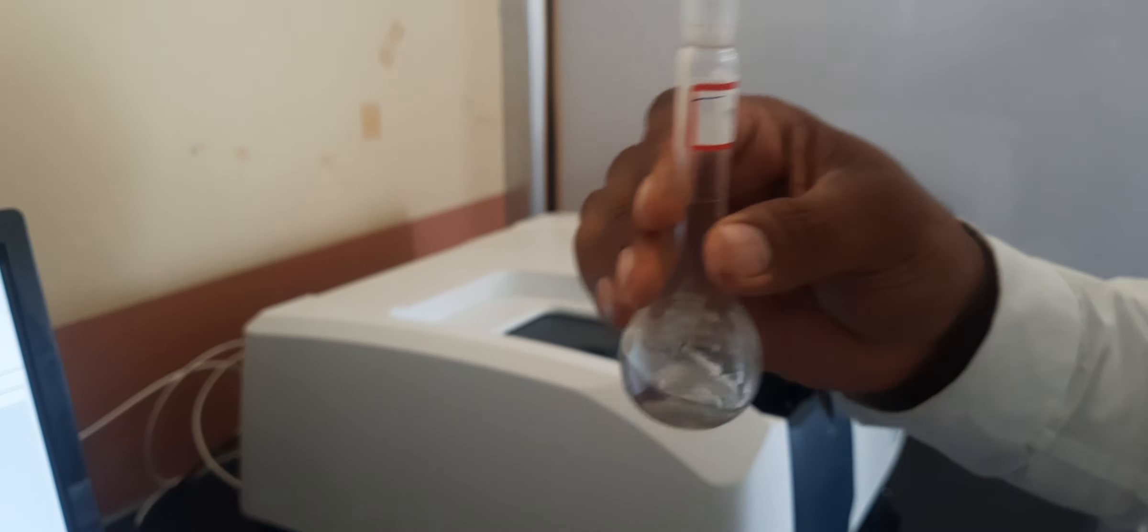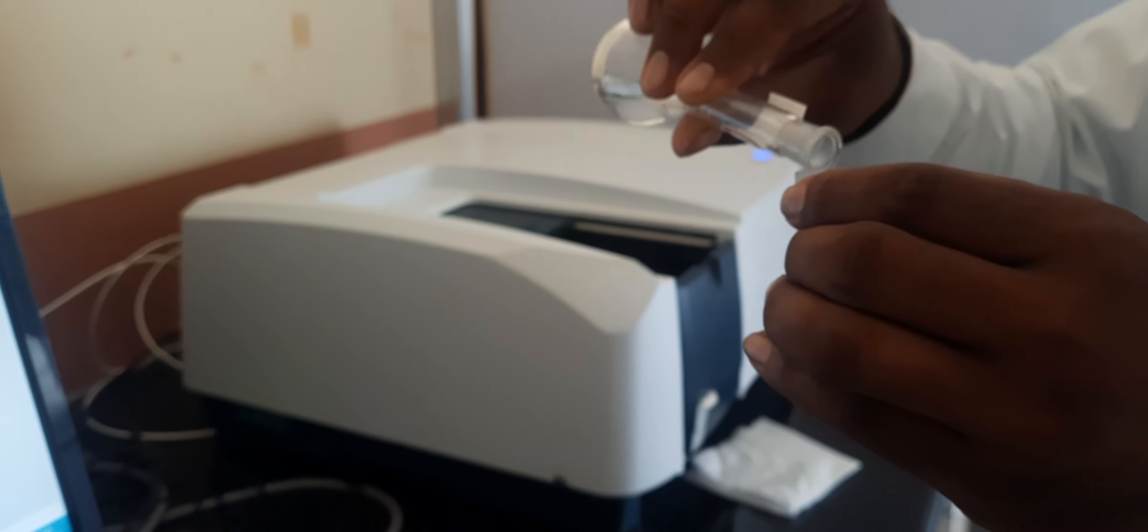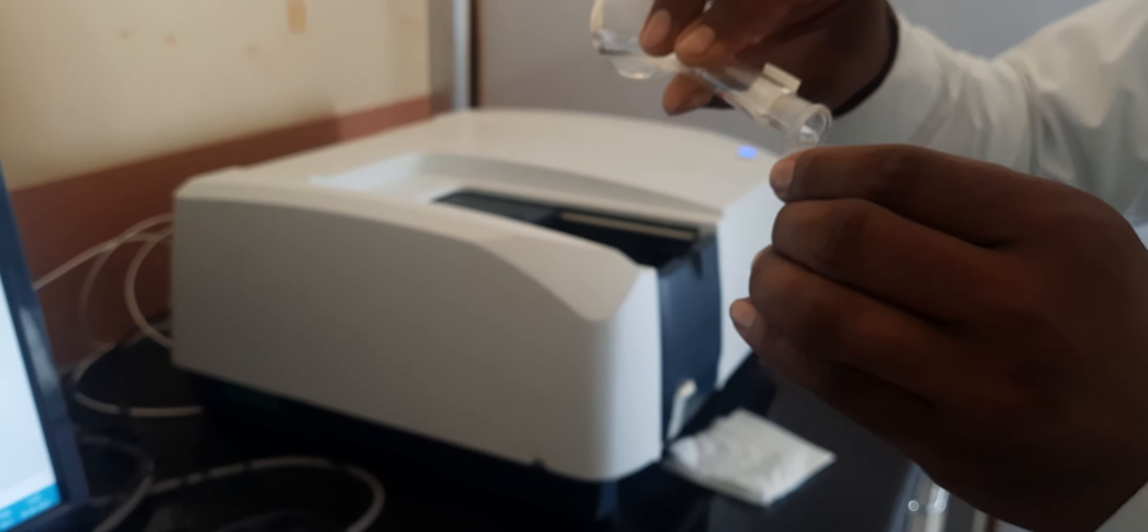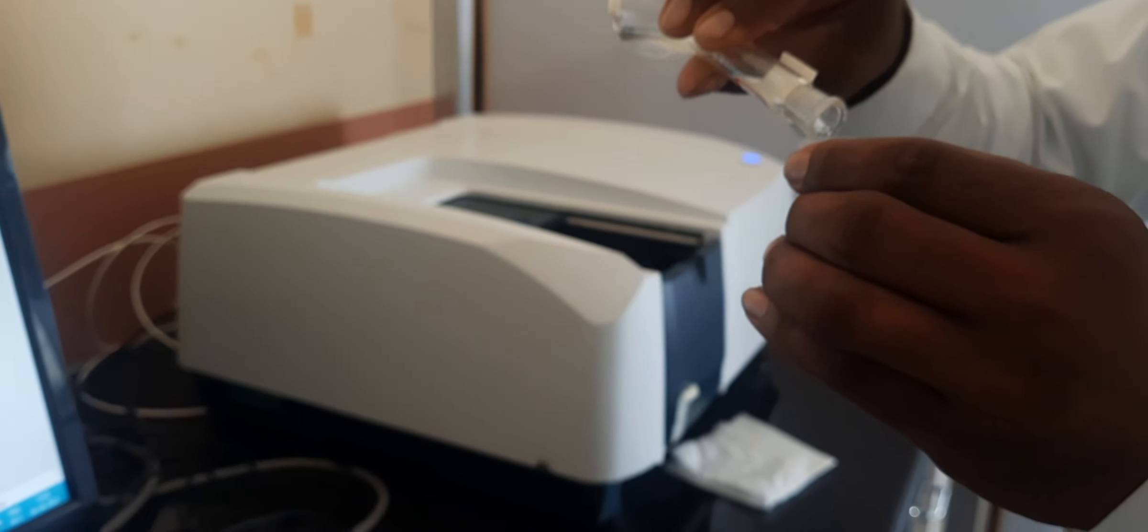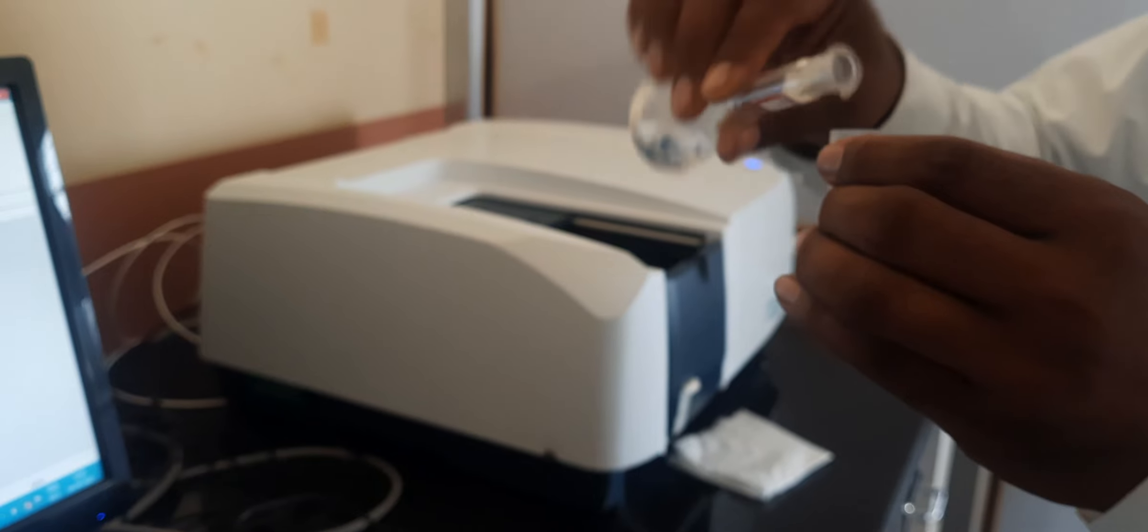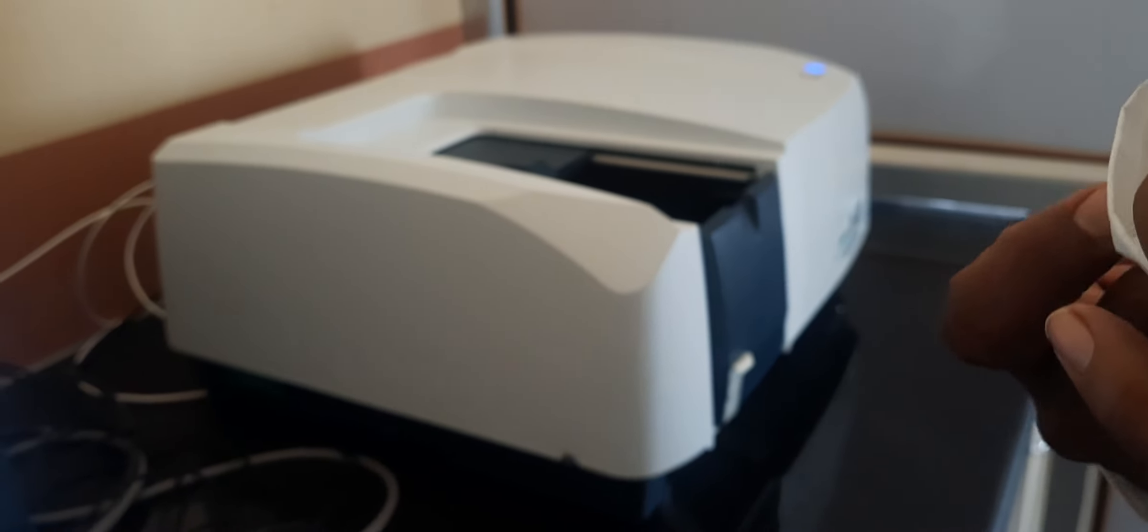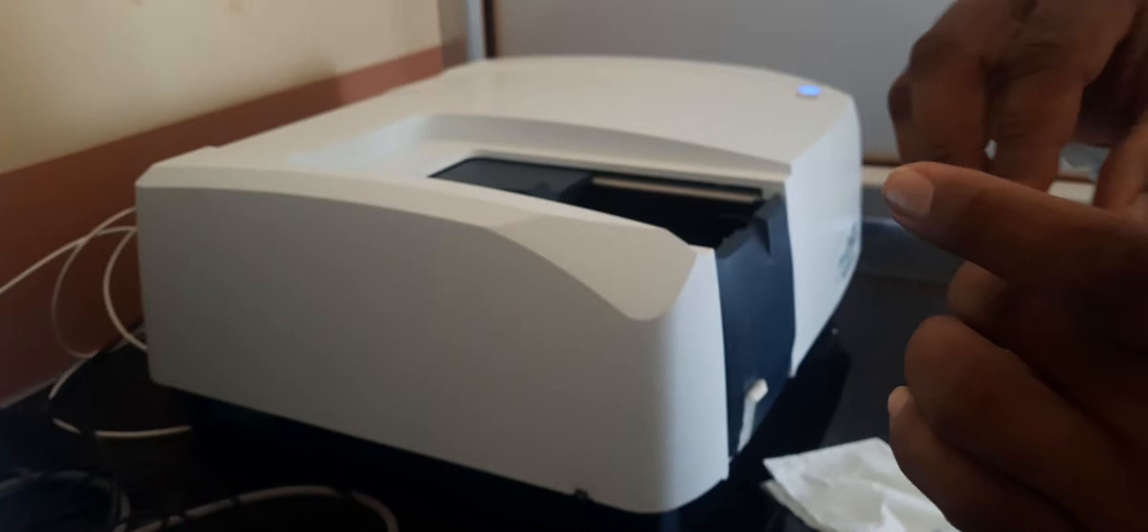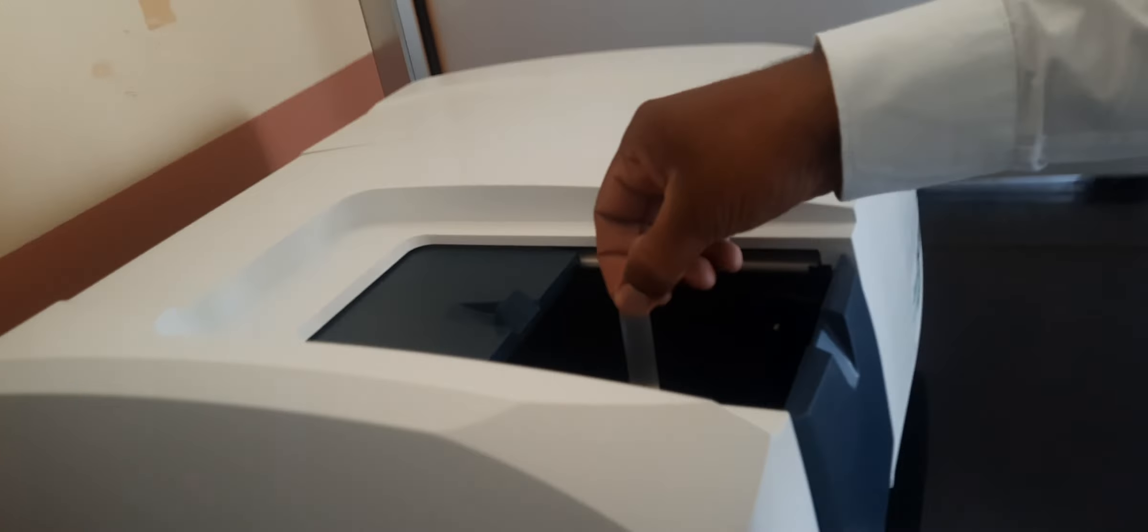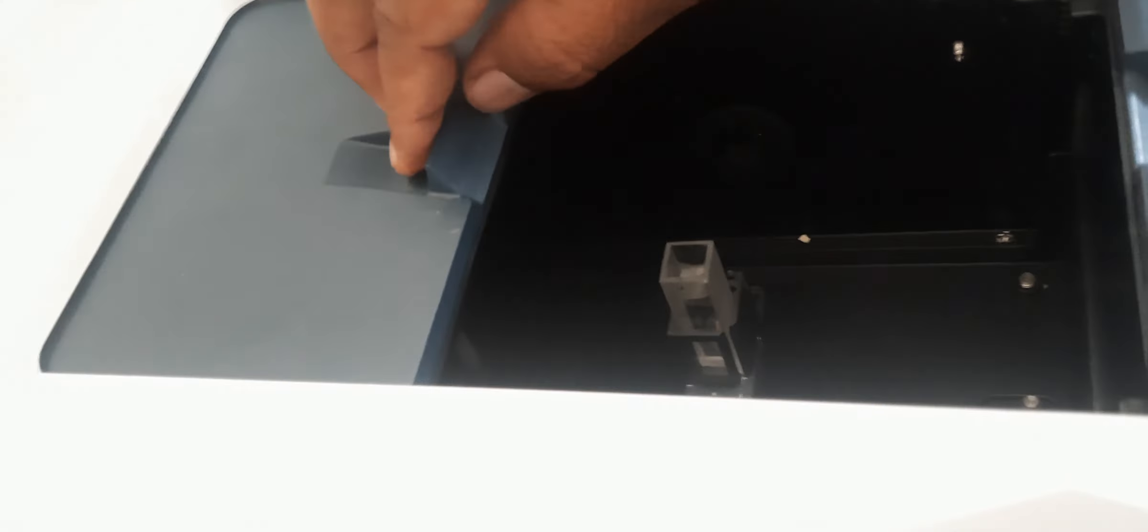Carefully wipe the cuvette with tissue paper and place it into the sample holder.